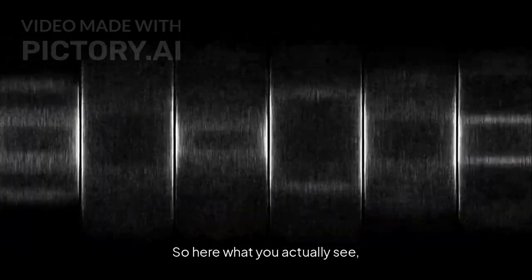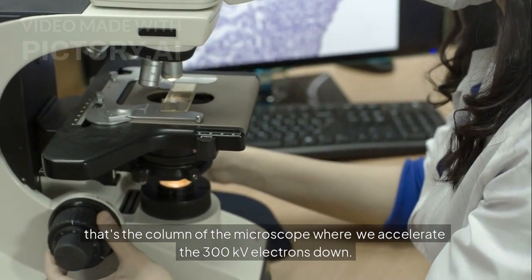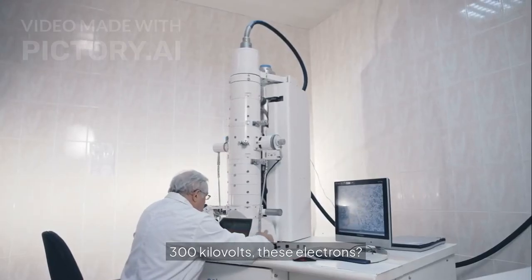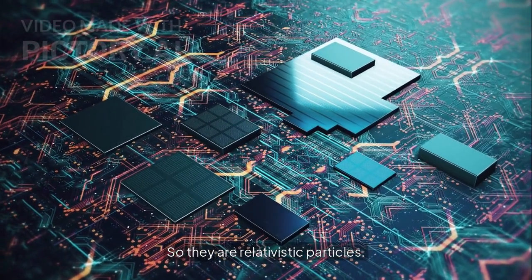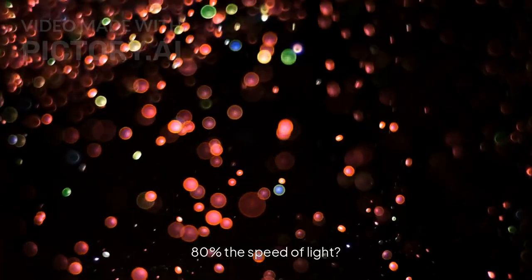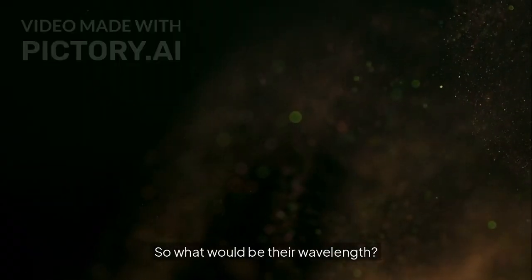So here what you actually see, that's the column of the microscope where we accelerate the 300 kilovolts electrons down. 300 kilovolts, these electrons? So they are relativistic particles. How fast are they moving? 99% of the speed of light? Around 80. 80% the speed of light? Yeah. So what would be their wavelength?